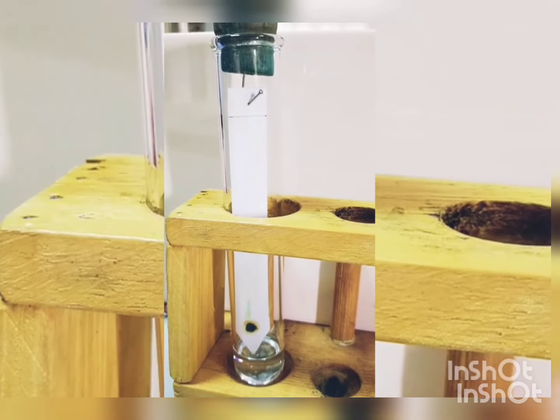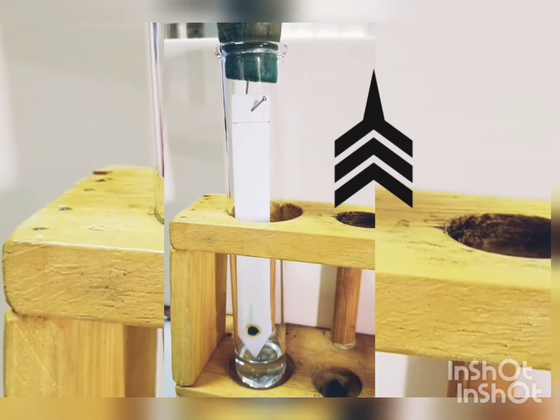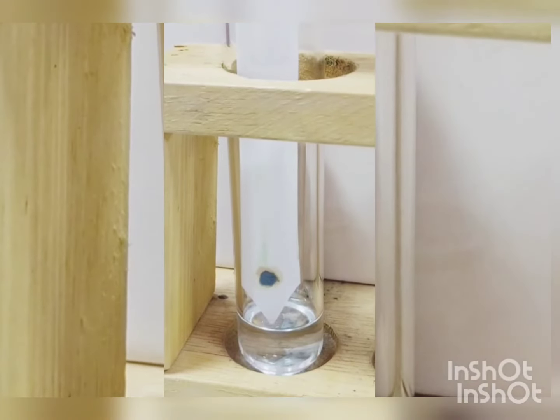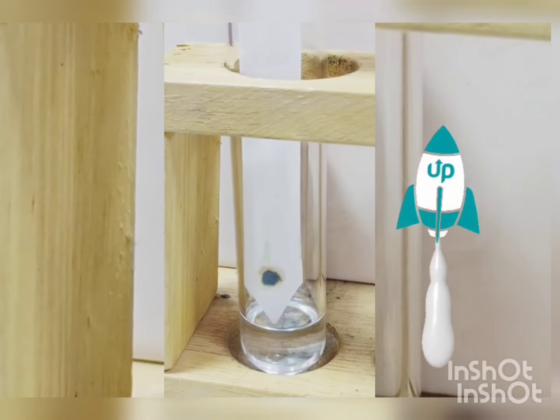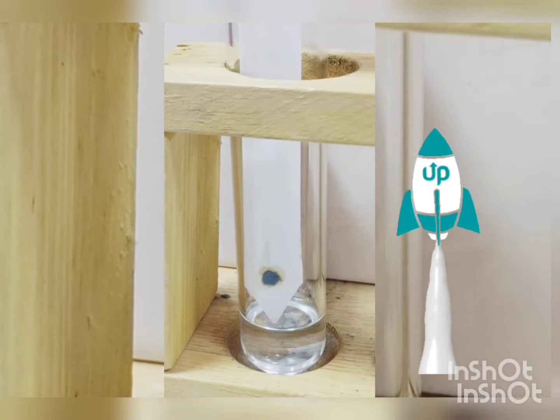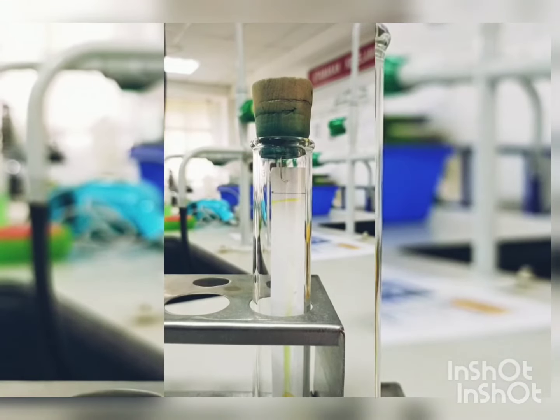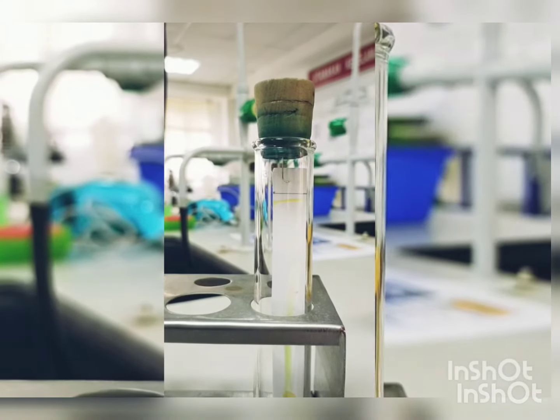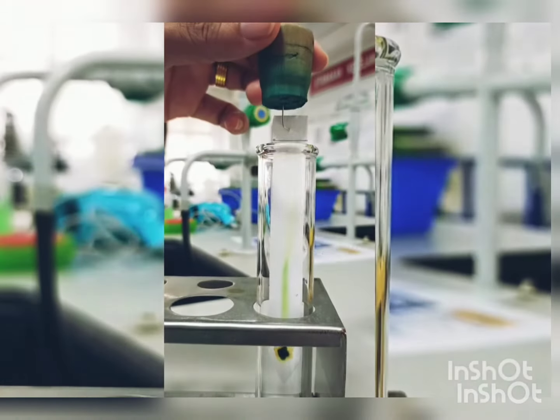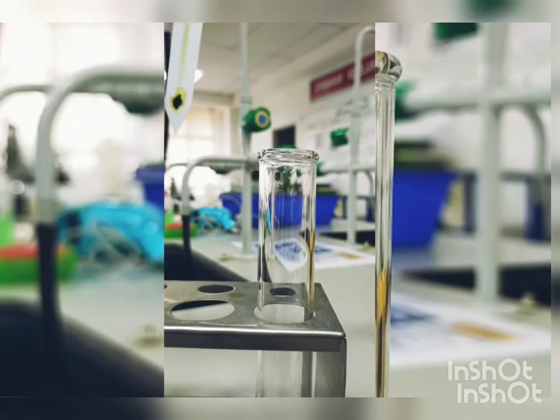Place the chromatography paper strips vertically in the tube rack. Let the solvent rise until its front reaches 1 cm from the top of the strip. Once the solvent front reaches 1 cm from the top of the strip, remove the chromatography paper strip from the boiling tube.